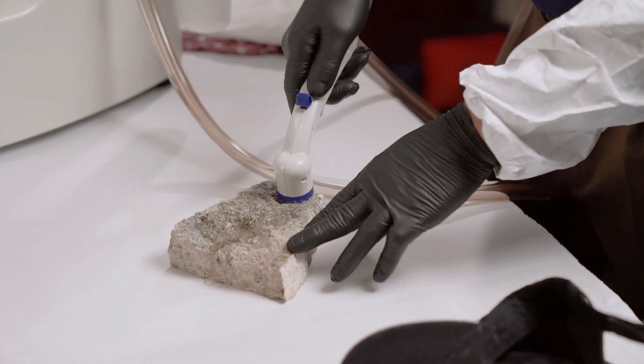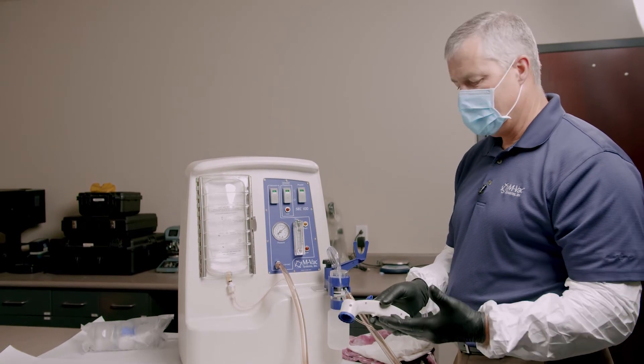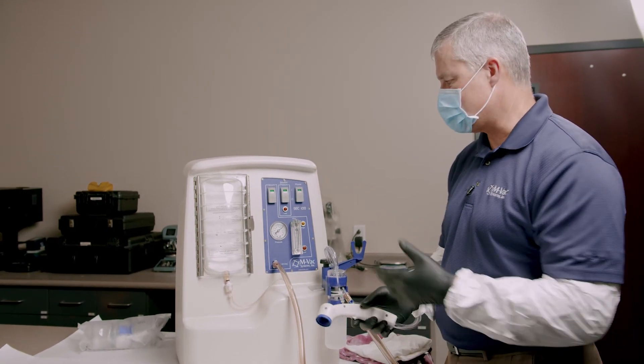It seems simple, but the training gives you lots of hands-on experience. By the end of that training you'd be able to take this system basically anywhere you needed to and take a good sample.